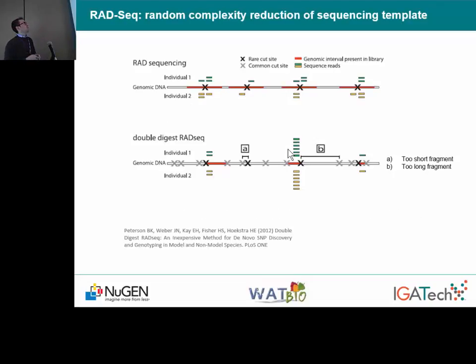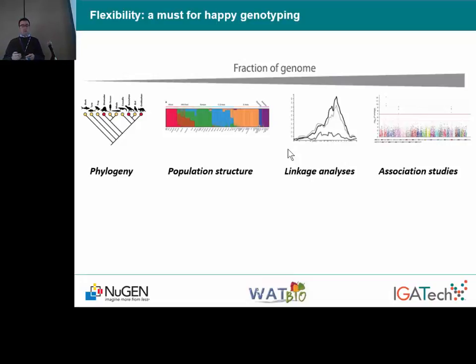I think we are all aware of genotyping by sequencing in the early meaning of the term, which is performed by using restriction enzymes to reduce the complexity of a genome. There are several types of protocols, some relying on a single enzyme, which is more or less a shotgun approach, and maybe more sophisticated protocols relying on two enzymes and site selection, which can provide more fine-tuning of the complexity reduction by limiting the number of loci. They work very well, but we might have some limitations. I will tell about this later in my slides.